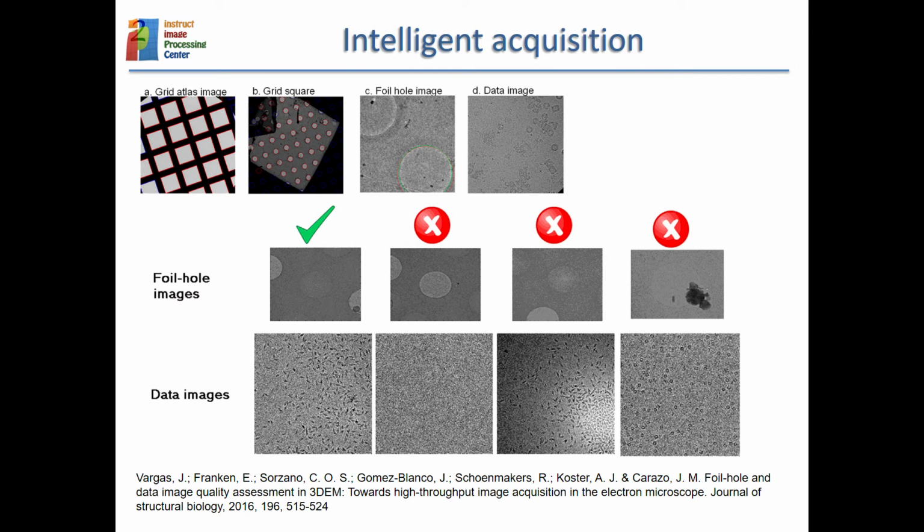And then there have also been some works that try to identify those regions in the micrographs or in the grids that are more promising, because the ice is relatively uniform, or it is not. For instance, you have here the carbon hole, so the carbon hole is uniformly covered by ice, or it is not empty, or there are no contaminations, or the ice thickness is not varying too much, or whatever other reason. And these are already incorporated in some of the automatic acquisition software.